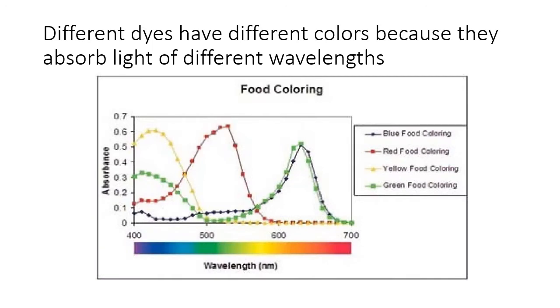Okay, so this just points out, and I'll show you this again later when it makes a little more sense, that different dyes do have different colors because they absorb at different wavelengths.